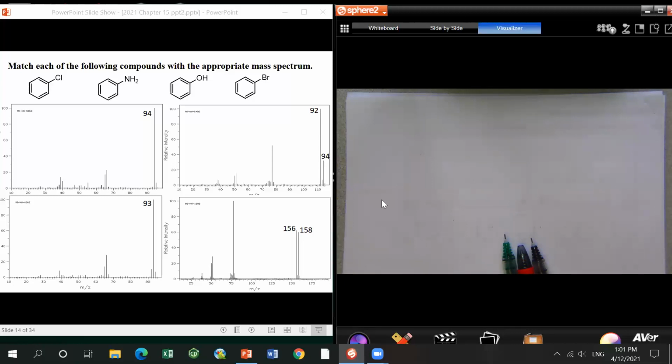All right, take a try. We learned in the previous lecture that some atoms give very special isotopic patterns, and the nitrogen rule.